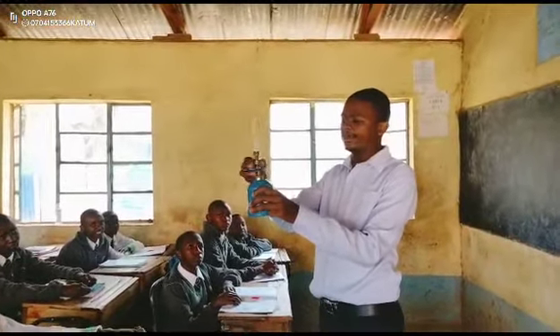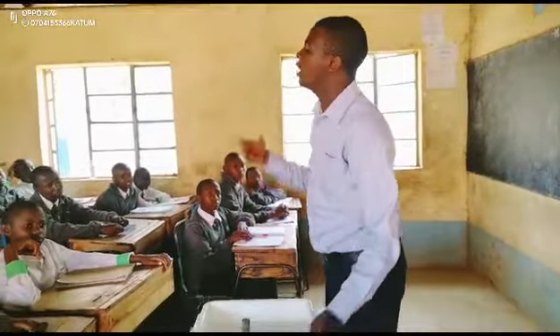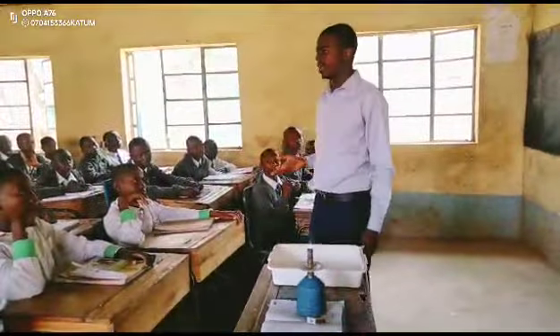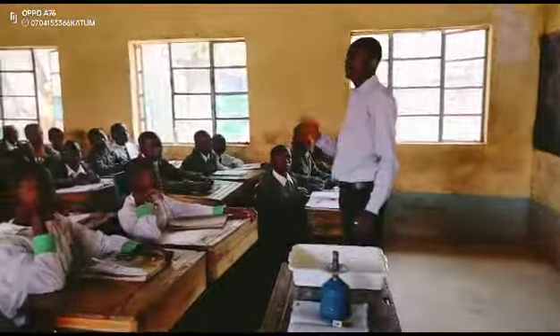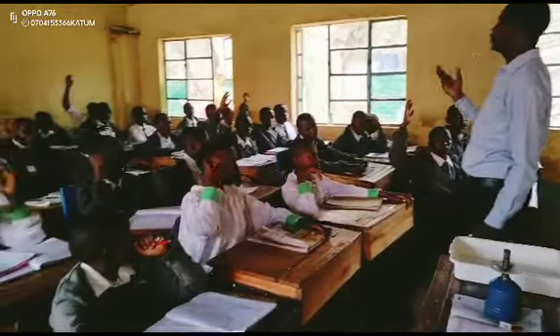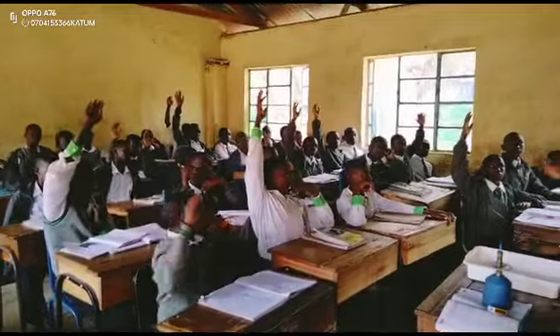non-luminous flame. Now, a question may be asked: how can you increase the hotness of the non-luminous flame in a Bunsen burner? Somebody give us the reason, or tell us how we can improve the hotness of the non-luminous flame in the Bunsen burner. Yes?